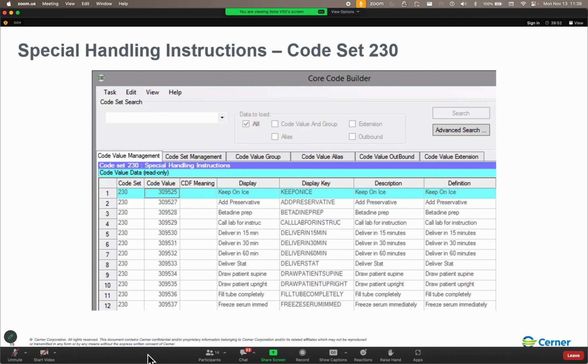Now, what you will have are CRM test 6024 and then a code set number. This is a back-end refresh. Now, folks, most of the time, you can wait the 10 minutes and let the code cache refresh server go ahead and refresh. In our case, we are wanting to get a jump on this, so we want to make sure that we don't have to wait that 10 minutes.